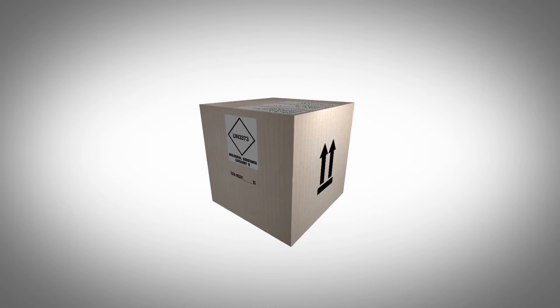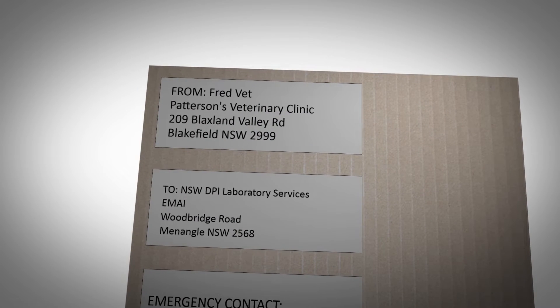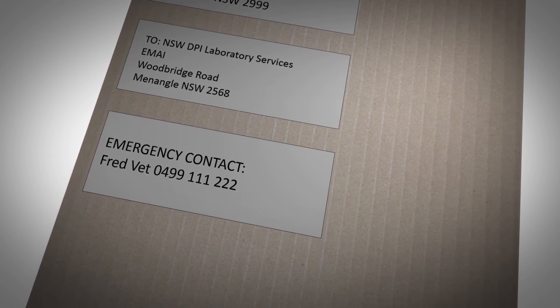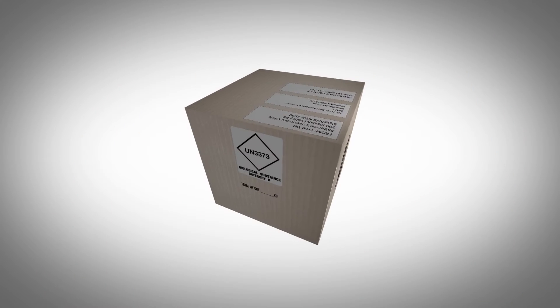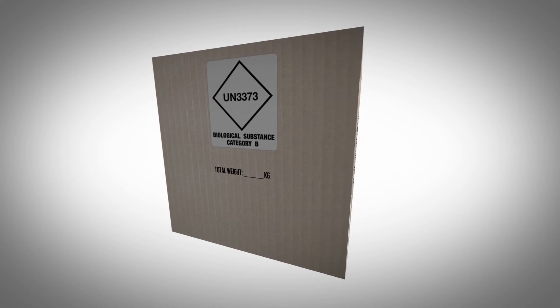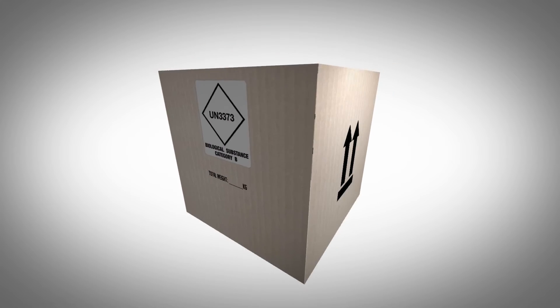Once you've packed your samples the outer packaging must be labelled as follows: name and address of sender, name and delivery address of receiver, emergency contact name and 24 hour phone number, UN 3373 label, biological substances category B and the orientation label.